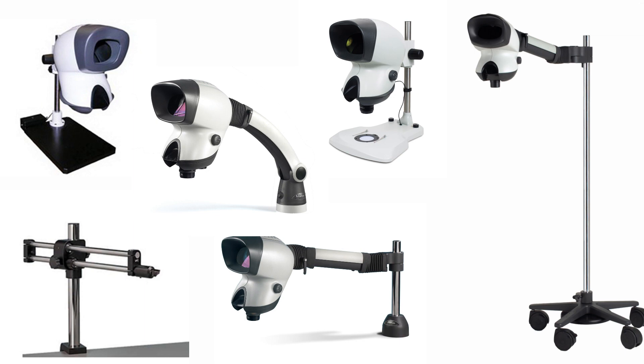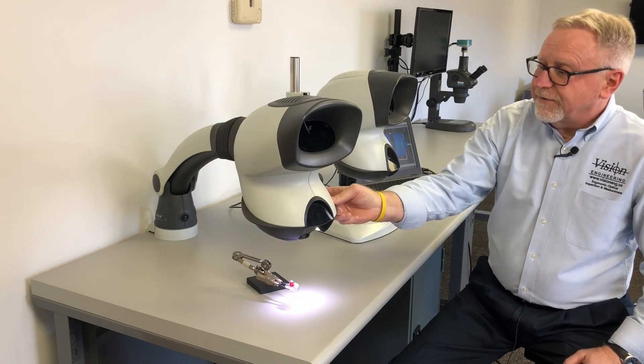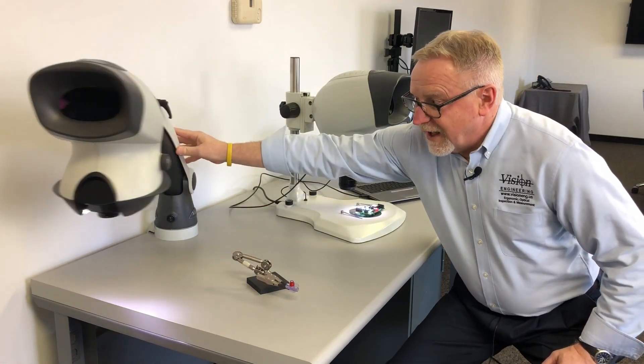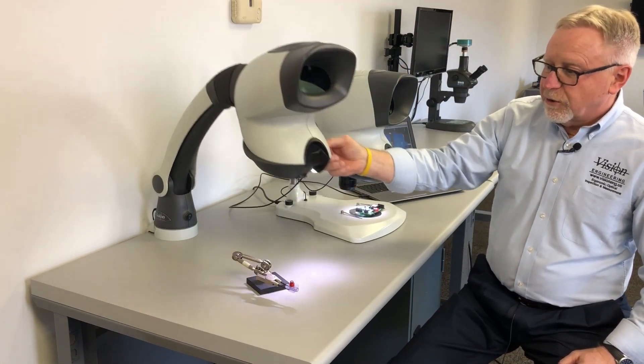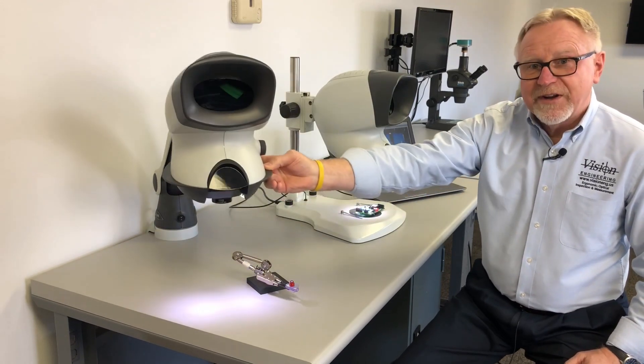Mantis systems come with multiple stand options. The most popular stand we offer is our universal or boom stand. It offers great flexibility and easy articulation — you can move it out of the way when you're not using it, and it easily adjusts for height and focus, fitting a wide range of operators.